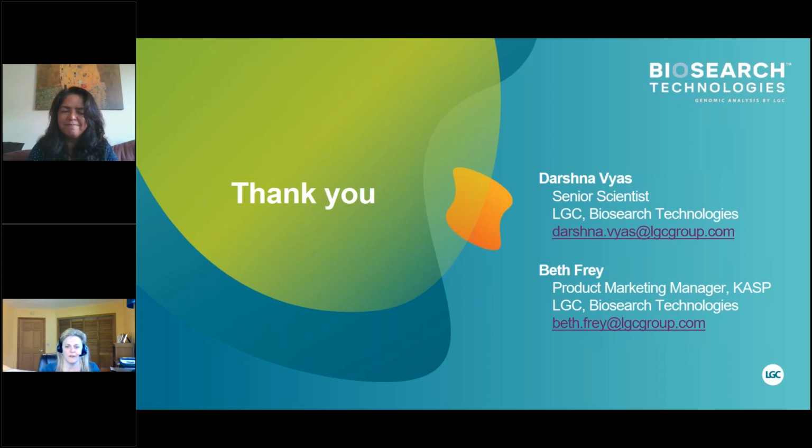All right, and if the audience has any questions about SeqSNP, they can type those questions in, and we can address them either today or address them by email afterwards as well. Absolutely. Another question: how would someone convert SSR to SNP?